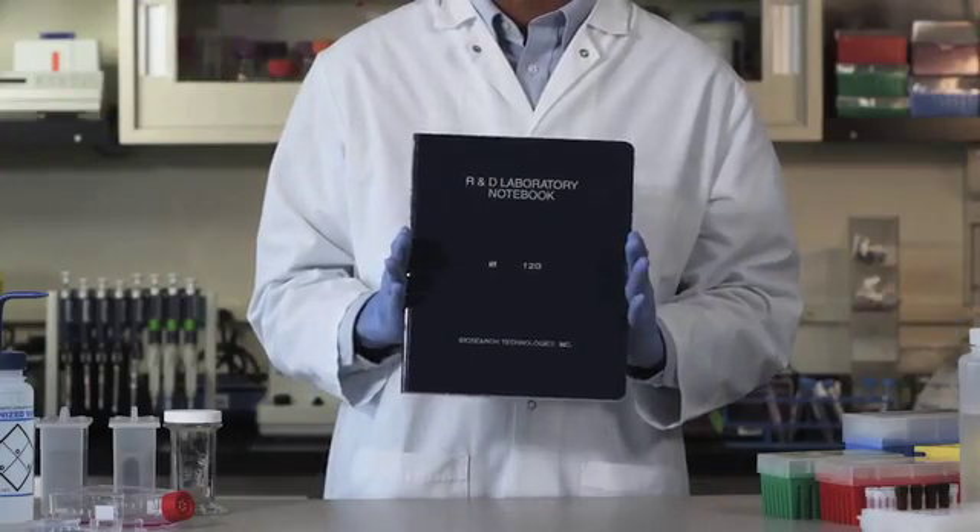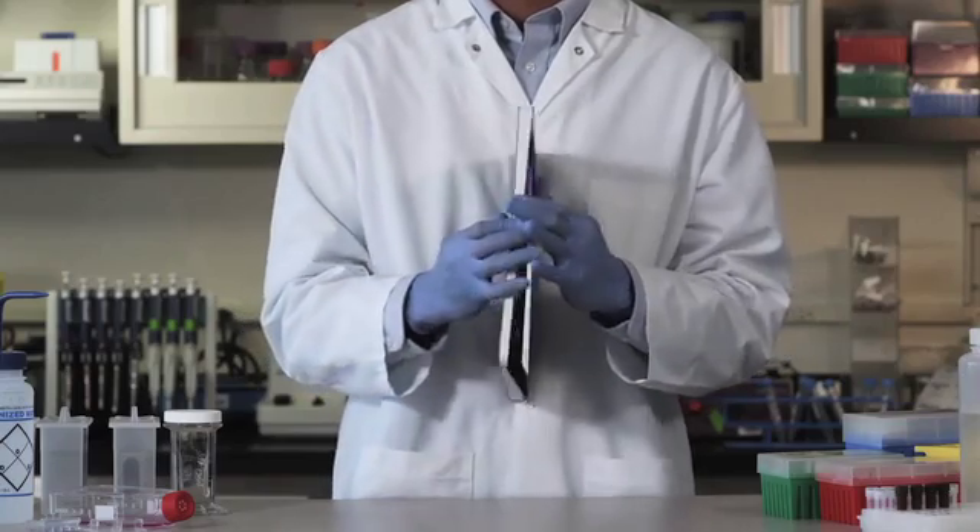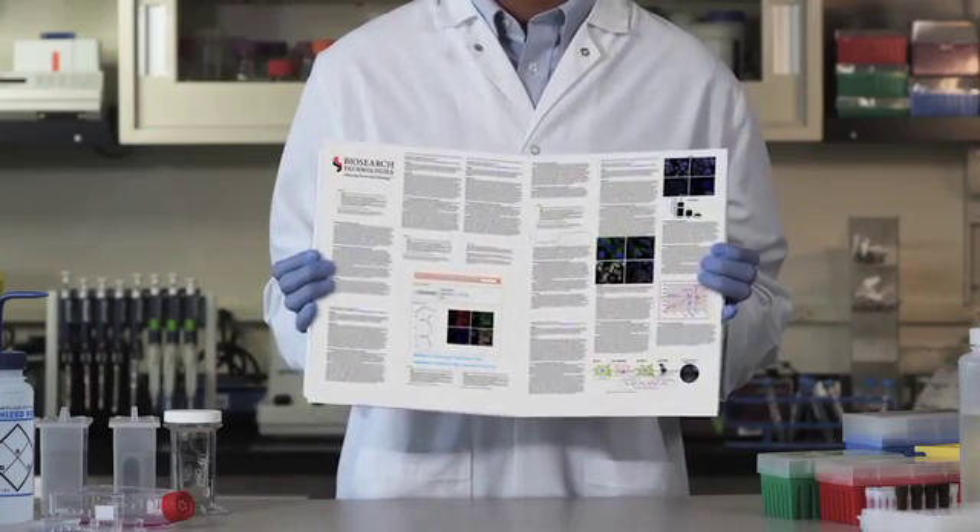From fixation to imaging, it just takes a few hours to get the solid results I need for a publication.